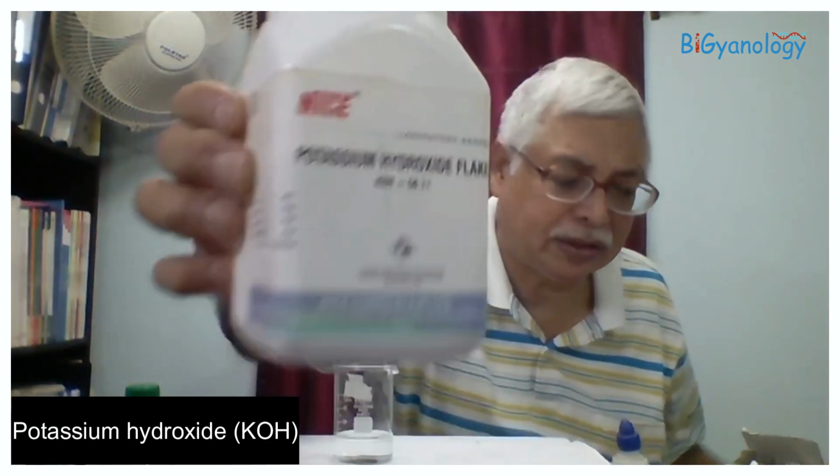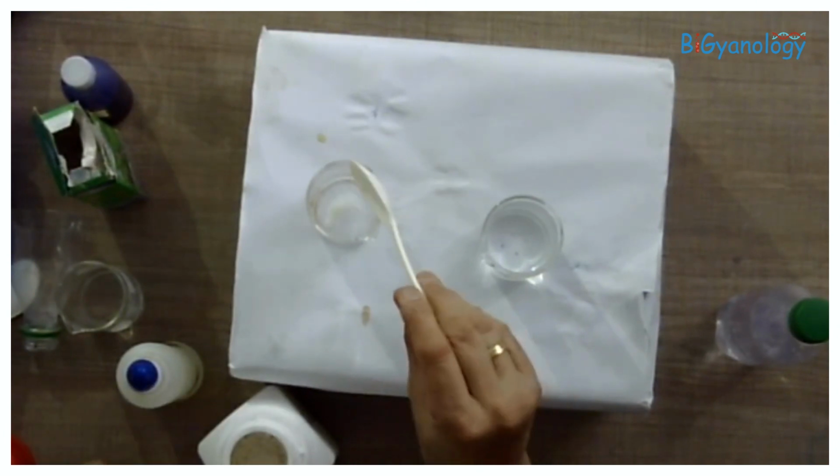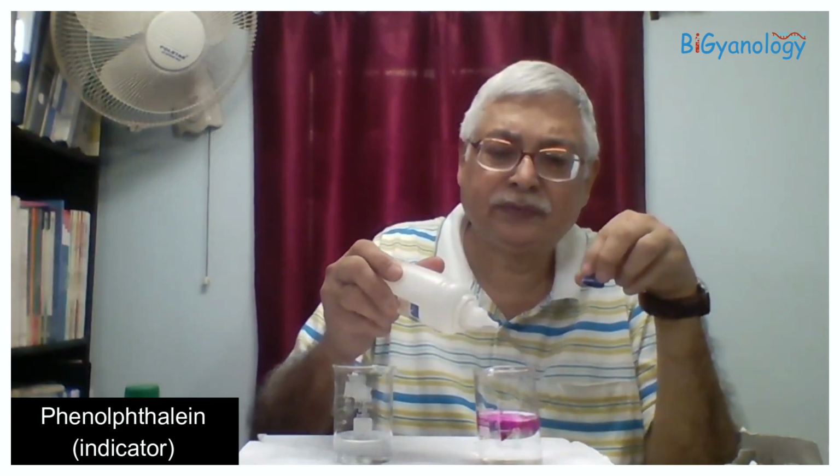But if we use a hydroxide like potassium hydroxide, any alkali, giving some potassium hydroxide and a little water, now if we give phenolphthalein indicator, this is alkali. This gives a characteristic pink color. So in acid no color, in alkali pink color.